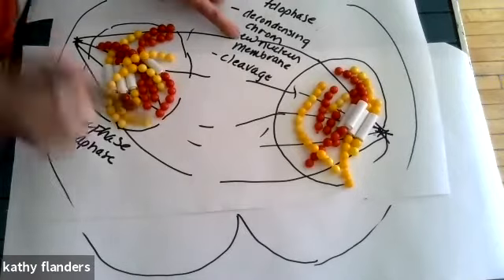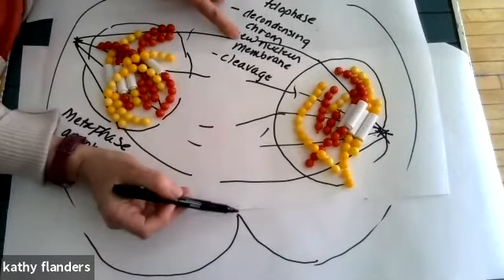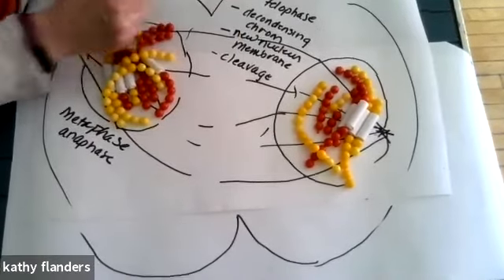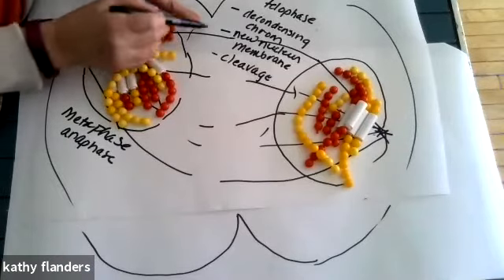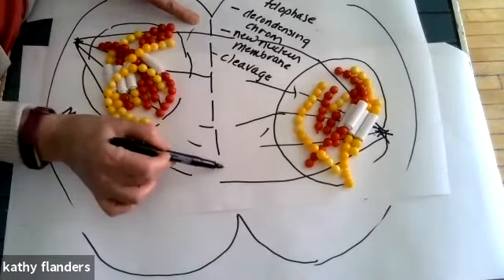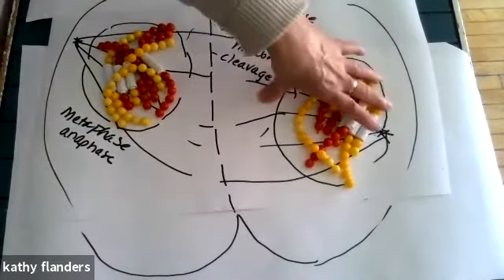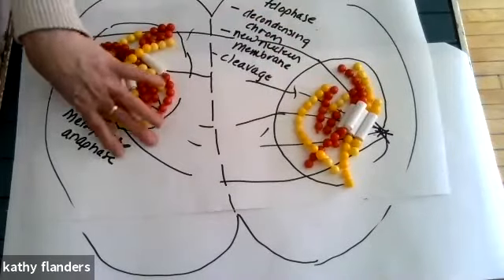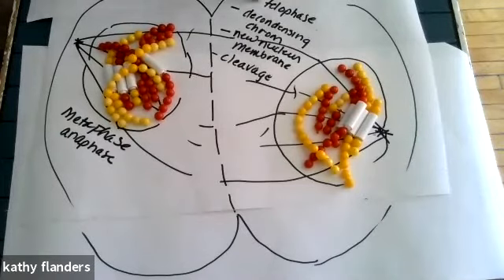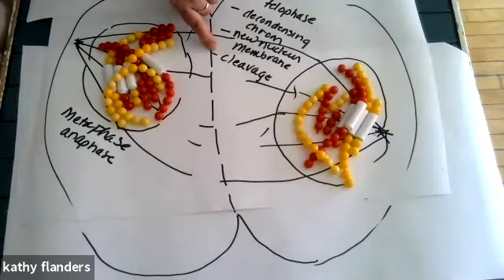Okay, so that's cleavage, is where we start to see the original cell membrane start to indent. Why is it going to indent? Because it's going to separate into two cells. So telophase is going to have the decondensing chromosomes, the new nuclear membrane formation, and cleavage.